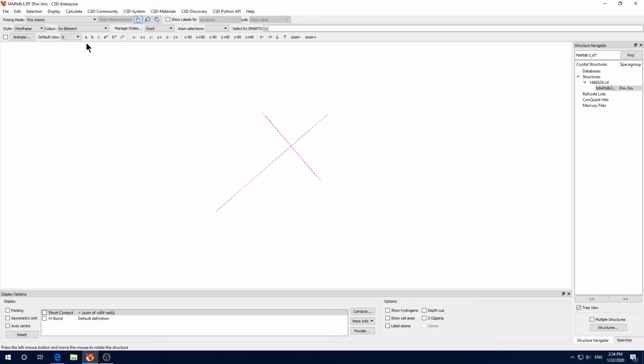Okay. If you want to change the view direction, you can click axis A, B, C. Also, you want to show the cell axes when you do it. So if you click A, you view along the A direction, and it's shown at the top left corner. And the other 2 axes are here. So when you click B, the top left corner indicates you are along the B axis, and C and A are here. So let's continue to explore different styles.